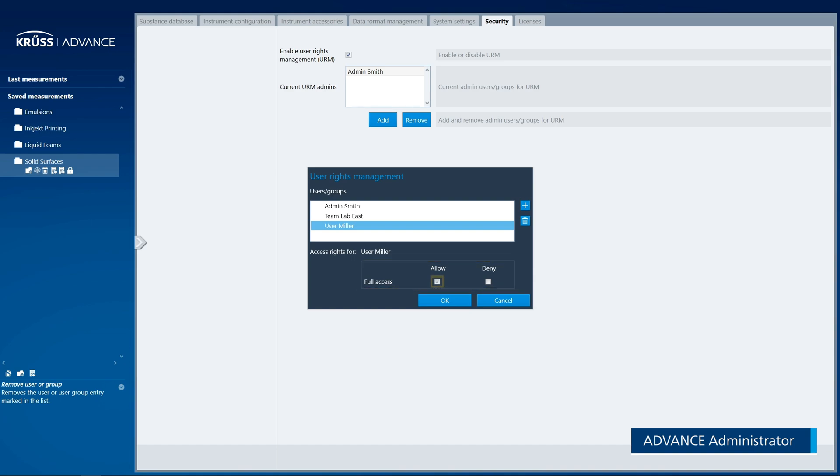If the Allow checkbox is ticked, then the user has full access rights to the element. If the Deny checkbox is ticked, then the user has no access rights to the element.